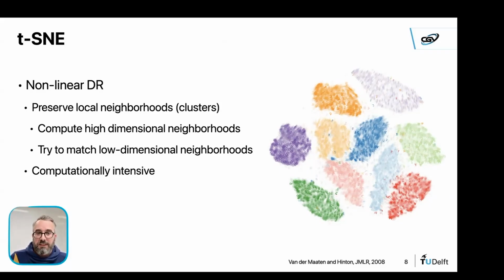Now, the issue with these is, even UMAP, they are computationally quite intensive, especially when we look at imaging data where we have hundreds of thousands of millions of pixels or even more, right? So I know you have these crazy data sets that are, I don't even know how big they are, so they don't even fit on a disk.